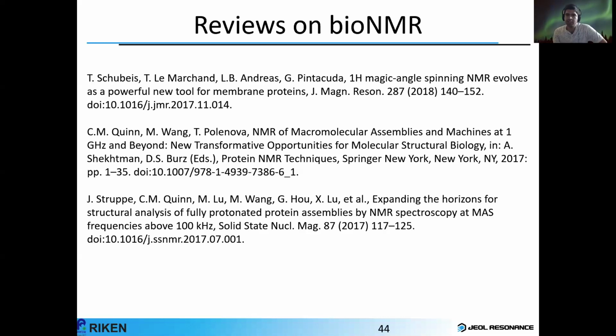All right. So just going back to that question on spherical rotors and the comparison with cylindrical rotors, I think Vipin had some thoughts to share on that. Vipin, do you want to unmute and share your thoughts? Yeah, sure. So Yusuke mentioned one factor, the strength of the material, but we should also consider another factor that is limiting, and it's the speed of sound. And we know when we get to the speed of sound, we get into these Mach regimes, with supersonic booms, etc., that happen.